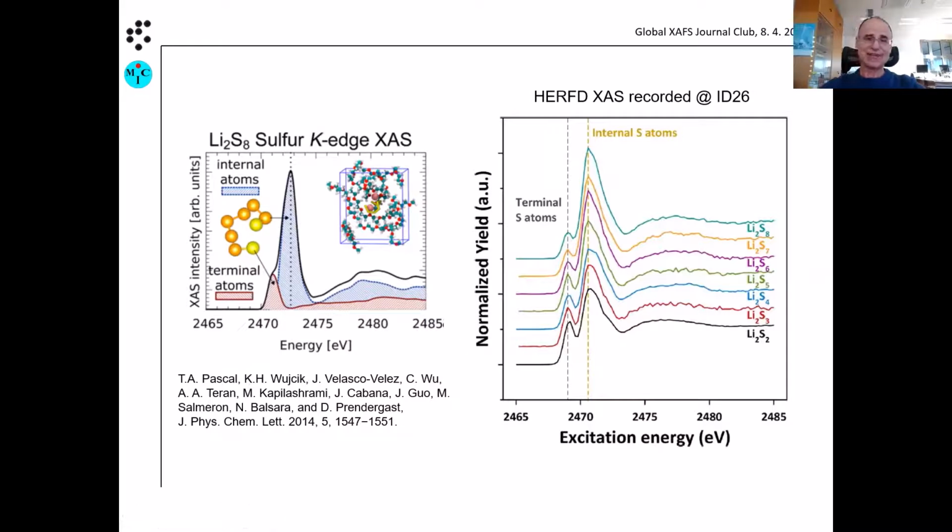Okay, I agree. Thanks. So this is the last one, and I want to show it because it will connect somehow later on to the emission work in the lab. This one was done on standards. From the left, the picture is taken from a paper from the Prendergast group from Berkeley. This is a purely theoretical work.